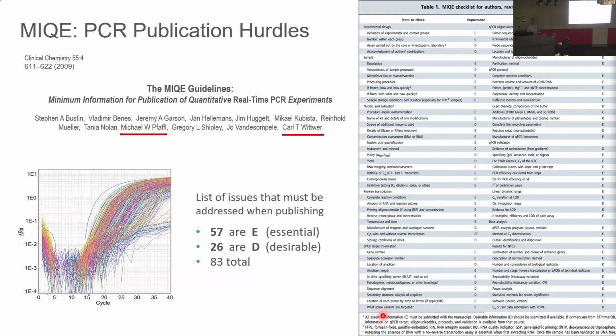And I presented nanoString at the same meeting, and they were very silent when they heard about nanoString. But they said to me, you know, Brant, PCR does work. It's just you've got to do all the right things, all the right checks and balances. And the problem is nobody follows the MIQE guidelines. That was their admission, right? It can work, but it's really hard when it comes to publication and getting results right.